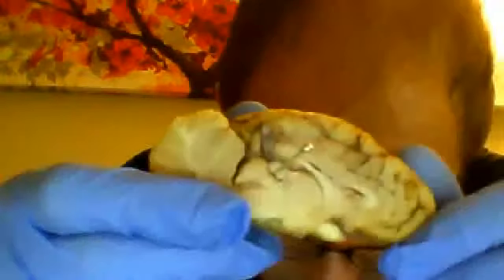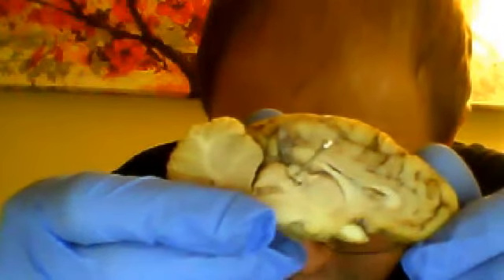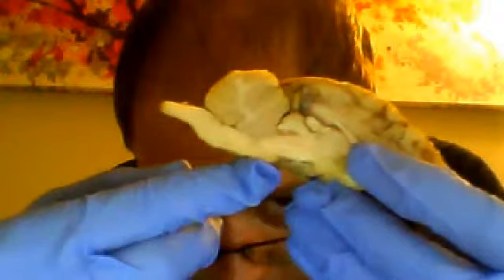Alright, next up we're going to move on to the pons. I may have already described this, but the pons is the area that is located right next to the superior and inferior colliculi. So that right there that I'm pointing to is the pineal body. The medulla oblongata, we've already kind of discussed that area here, and the pons, which is that area here.